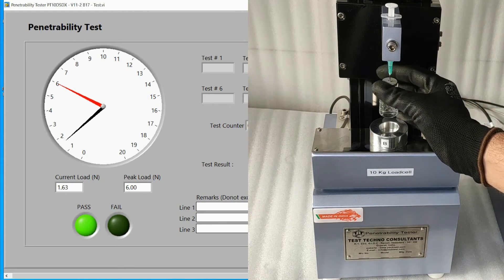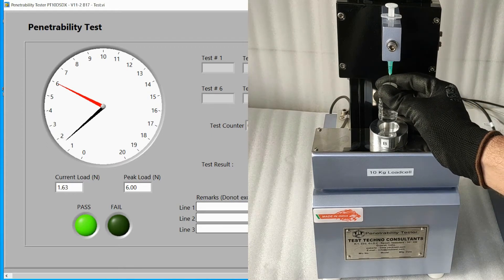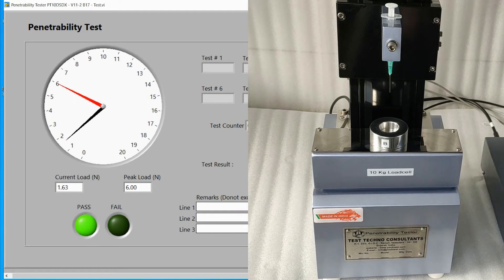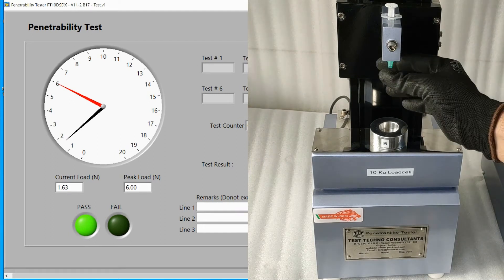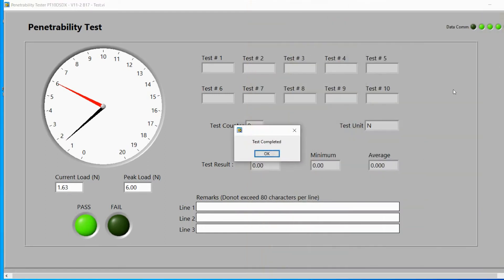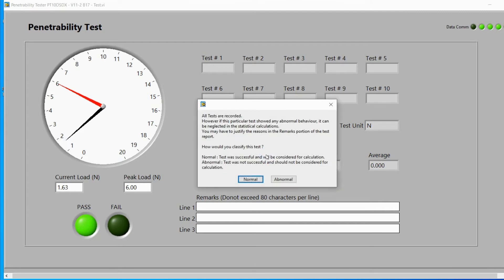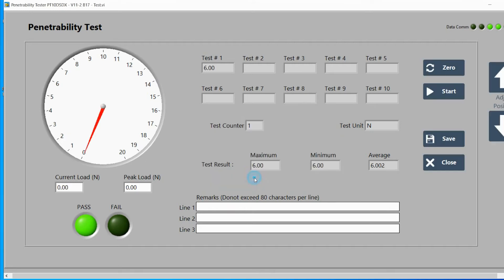Upon completion of the test, replace the vial and the needle. A test completion prompt will appear — click on OK. You will now see another prompt; select normal or abnormal depending on the test conditions.